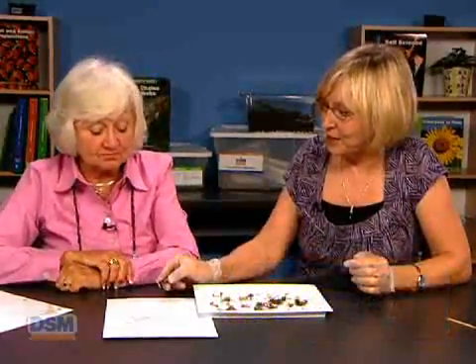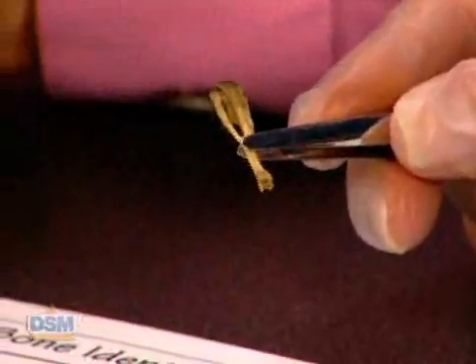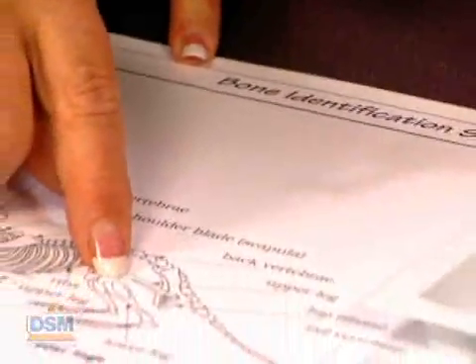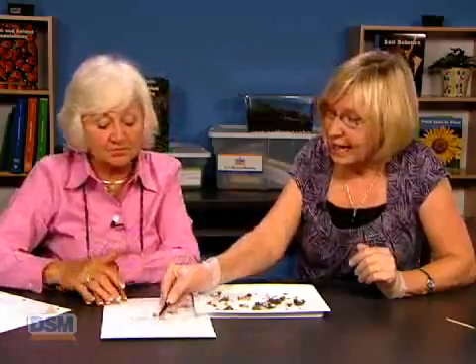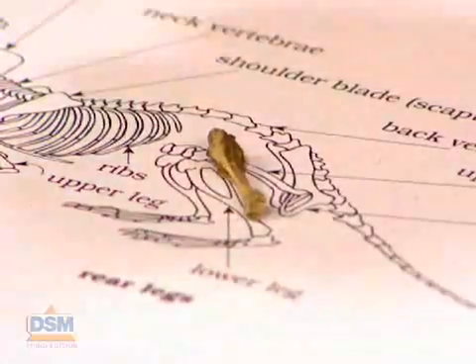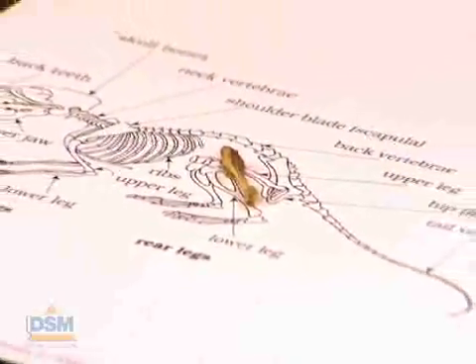Okay, I have another interesting looking bone here. If we want to use our bone identification sheet, let's see if we can find any bones that might match this. Look at the hole between those 2. I wonder if that might be the lower leg. Okay, and as students are identifying bones, they might take those bones and actually lay them on their bone identification sheet to see if they can even construct the whole creature.